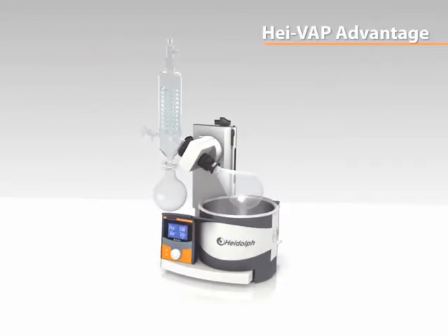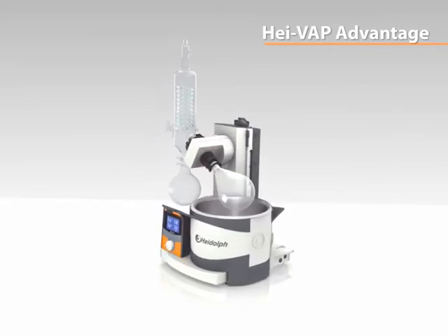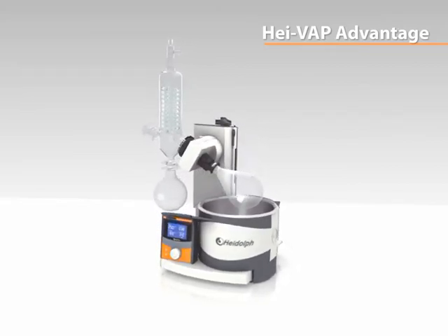Take advantage not only from the general benefits of the Hei-VAP series, but in addition from the specific features of the Hei-VAP Advantage.